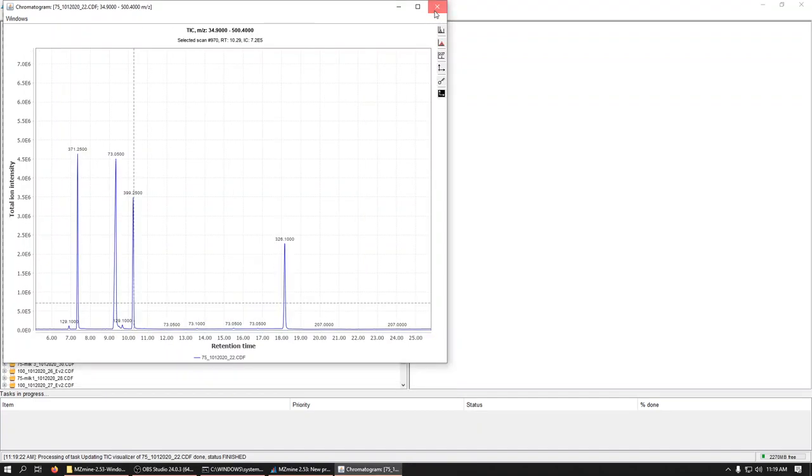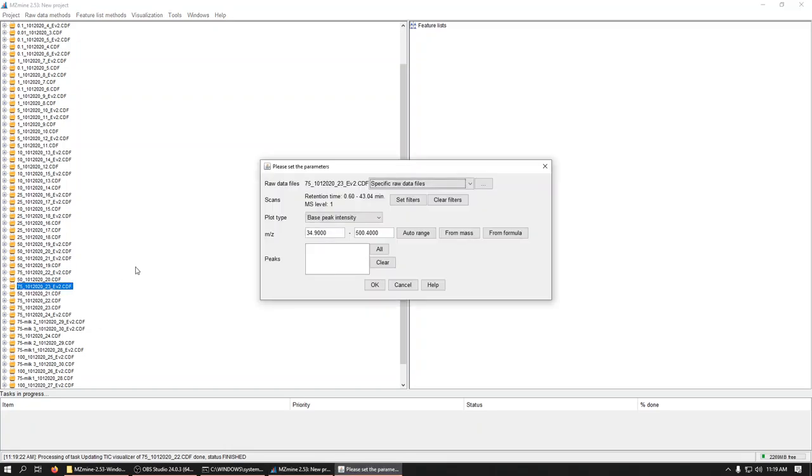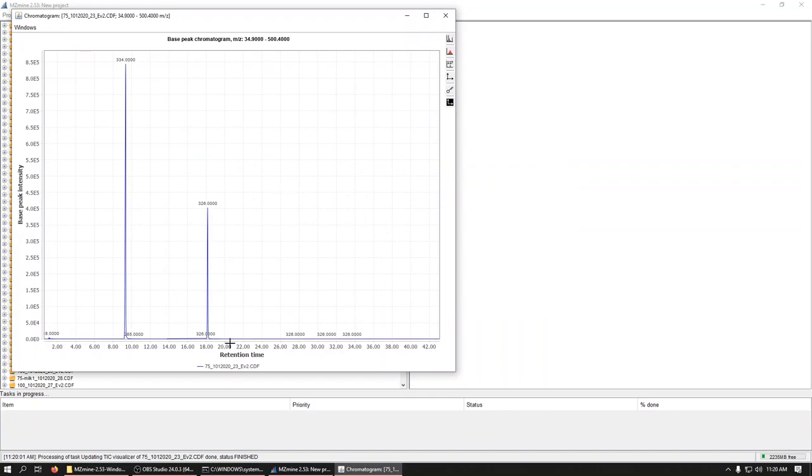The other set of data that we imported here, the event 2. This data was collected with a SIM scan mode on the Shimadzu. So it was doing a TIC and also doing some selected ion monitoring. If we pull this same one up, here we can see it's much cleaner. And we've got one, two peaks.